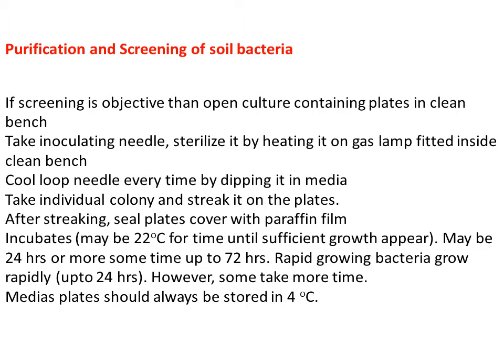Take inoculating needles or inoculating loops. Sterilize it by heating it on the gas lamp. This loop or needle must be cooled every time by dipping it in the media.